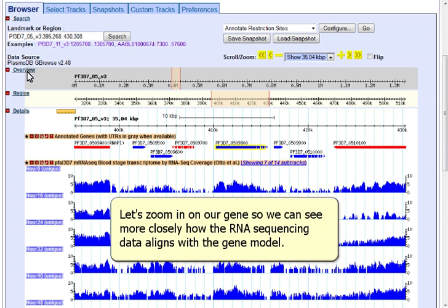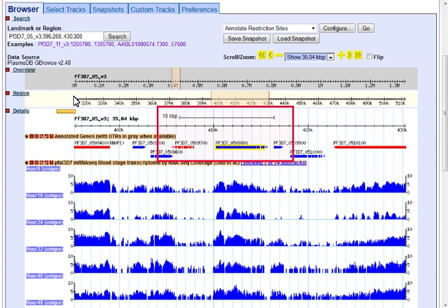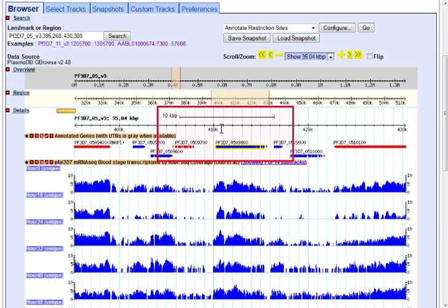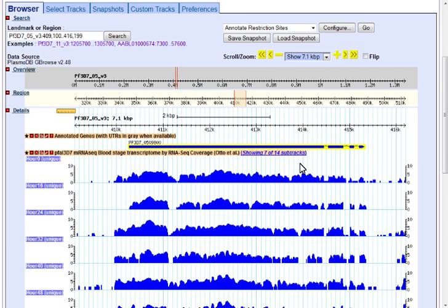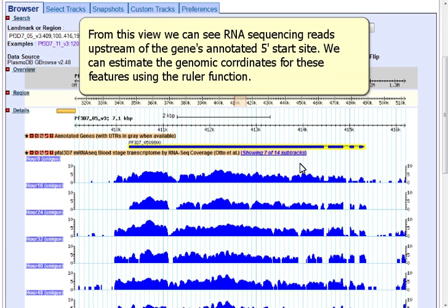Let's zoom in on our gene so we can see more closely how the RNA sequencing data aligns with the gene model. From this view, we can see RNA sequencing reads upstream of the gene's annotated 5' start site.